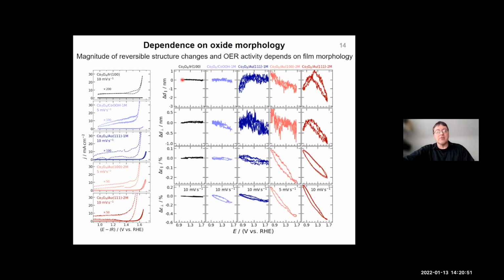And here on the very left, in black, is actually a film produced by the Libuda group in Erlangen by UHV epitaxial growth. And you see that you have some samples where there's almost no change in the surface structure, so there's almost no skin layer formation. In some, you find a skin layer that is between 1 and 3 nanometers thick.